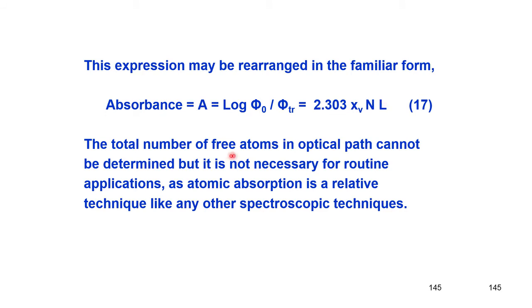So, the total number of free atoms in the optical path we cannot determine. There is a catch here. We cannot determine the total number of free atoms. So, how do you quantify? But fortunately, it is not necessary for routine applications.